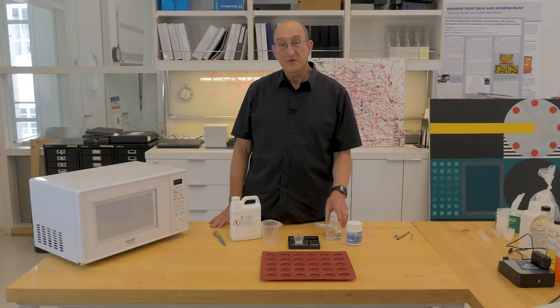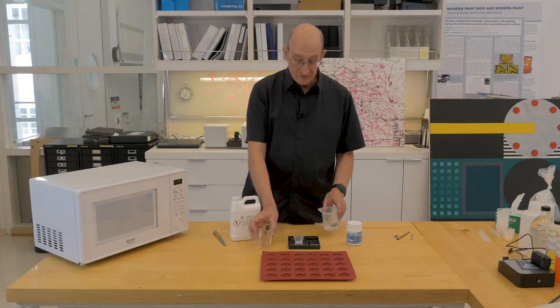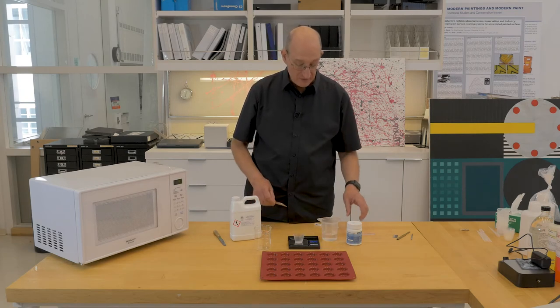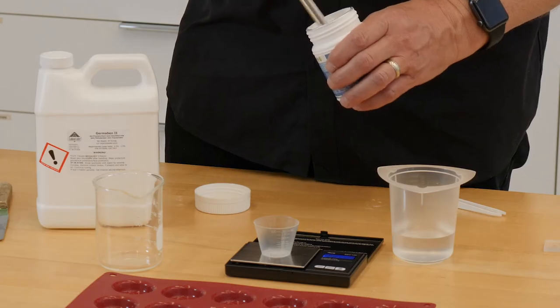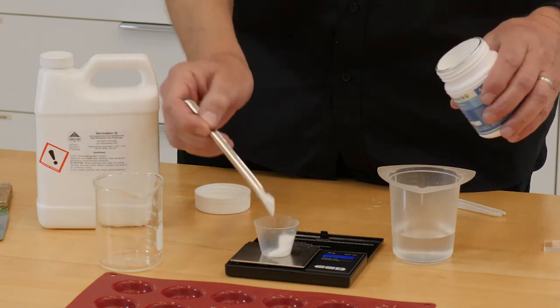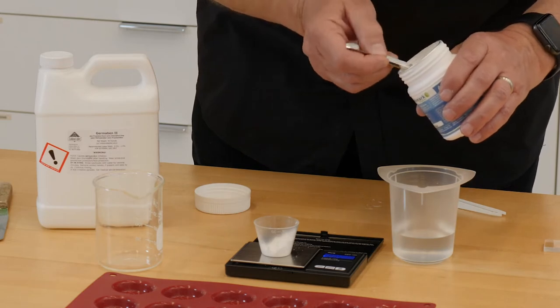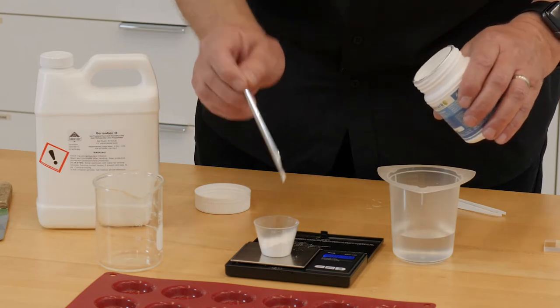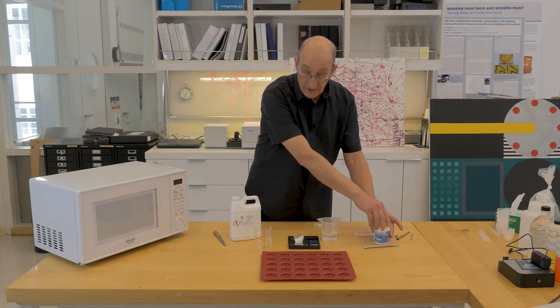We're going to make a 4% solution. So we take 100 mils of water — the amount isn't critical. Place it into a plastic container because when we cook in the microwave, we will not want to handle a glass container because it gets very hot. We'll measure out 4 grams of the agarose and mix that into the deionized or distilled water.